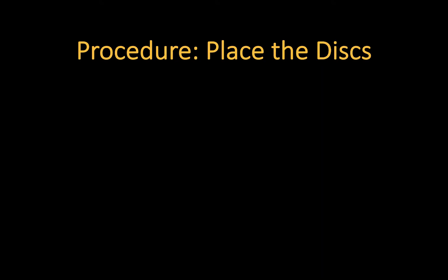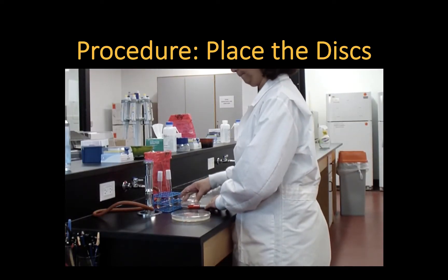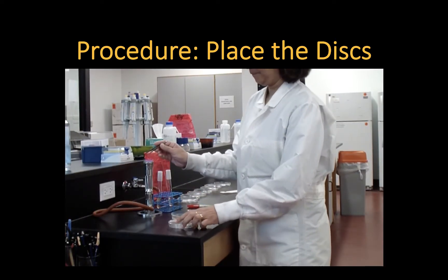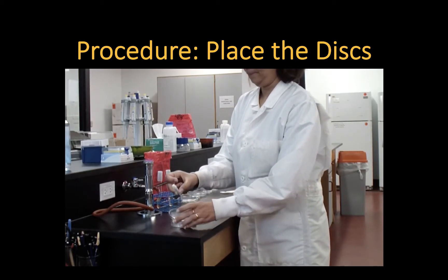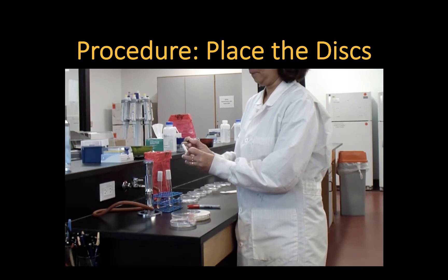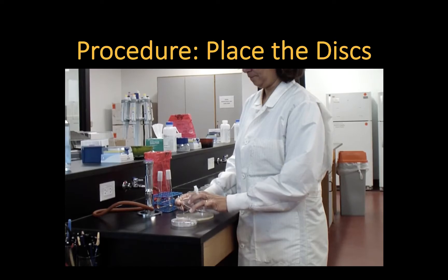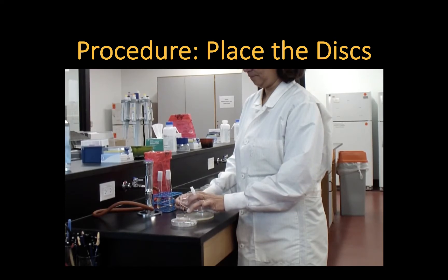Now you're ready to place the antibiotic disks on the medium. Use metal forceps to place the antibiotic disks. Be sure to flame the forceps before and after you touch the disks. Remove the disks from the plastic dispensers by pushing them out from one side and pulling them out from the other side.